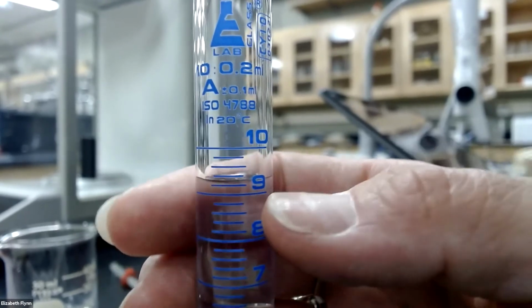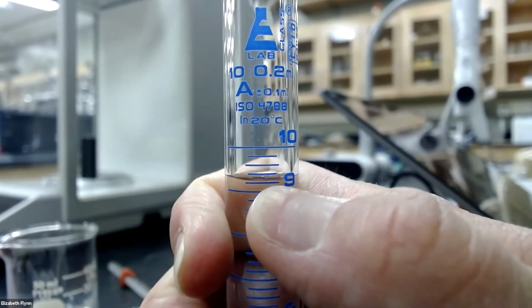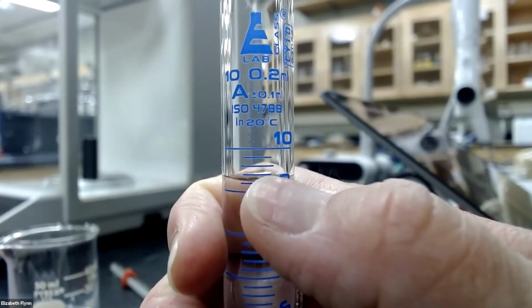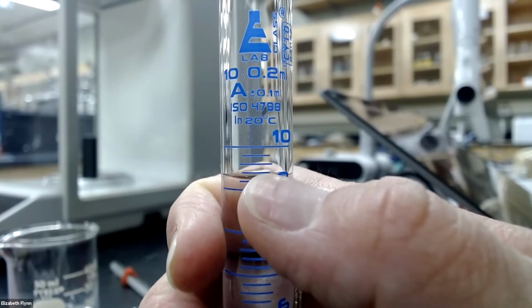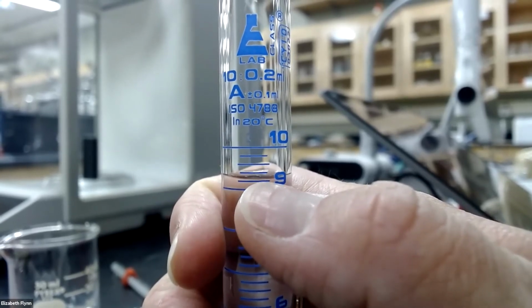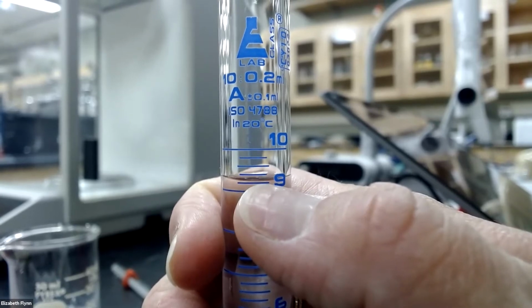Okay, so we know for sure it's 9.2 and it's in between these two. So it's not 9.2, it's not 9.4. The first time we're estimating, it has to therefore be the 9.3. Okay, so again, our volume will be 9.3 milliliters.